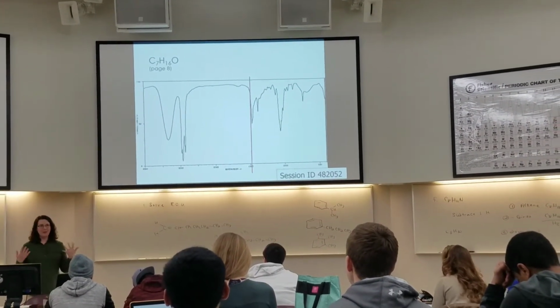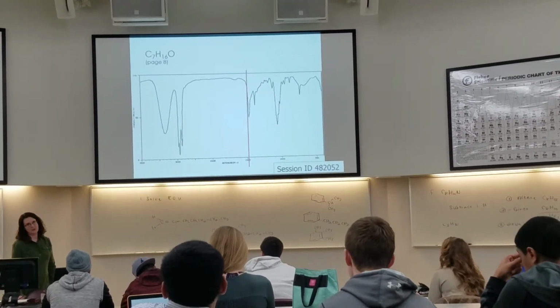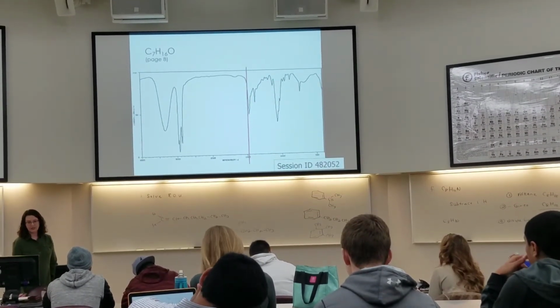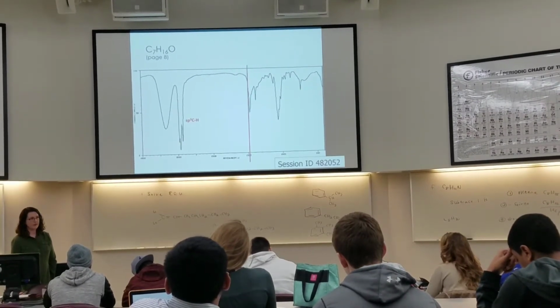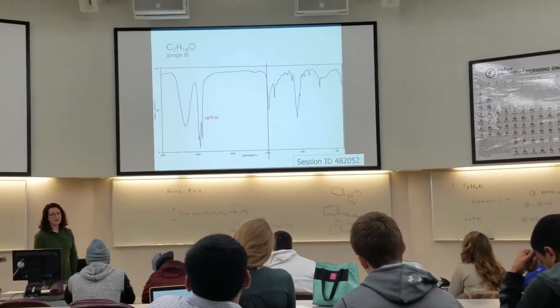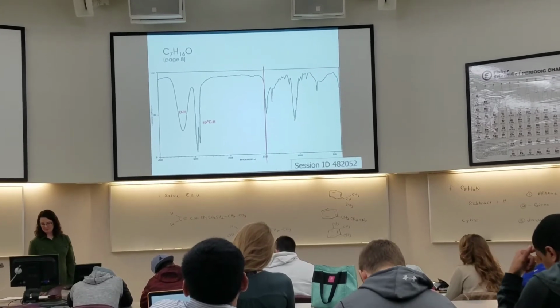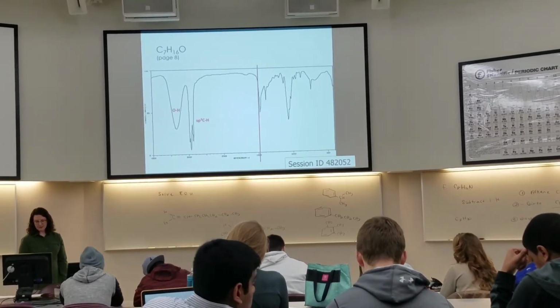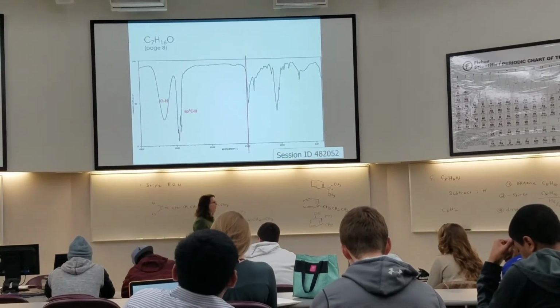So anyways, what do you have left? I think you recognized it right away, but still start with the carbon-hydrogen stretches, right? So sp3 carbon-hydrogen, 2800 to 3000 wave numbers. And then the one to the left is a smooth, wide OH. Good. Okay, so what does this structure look like?